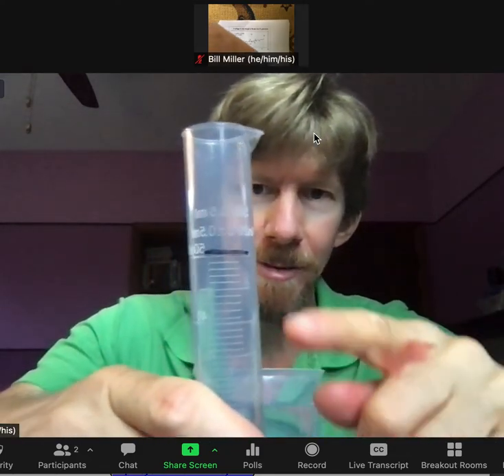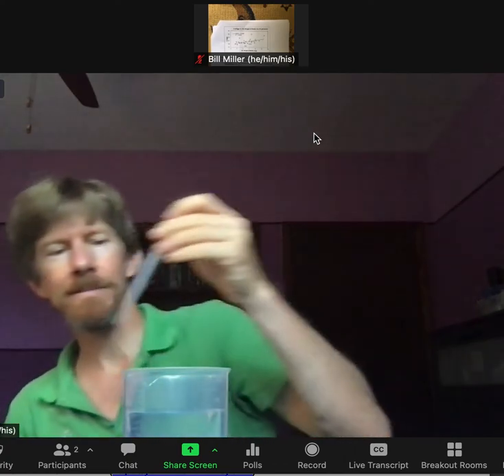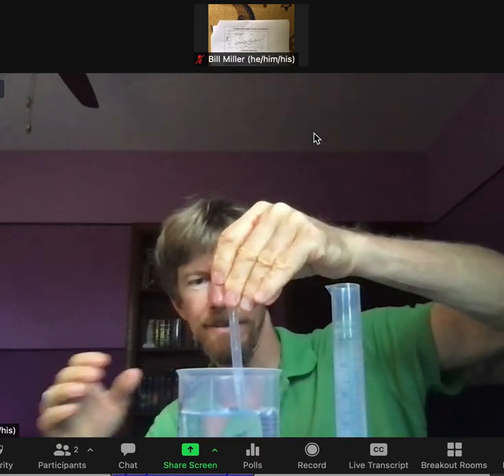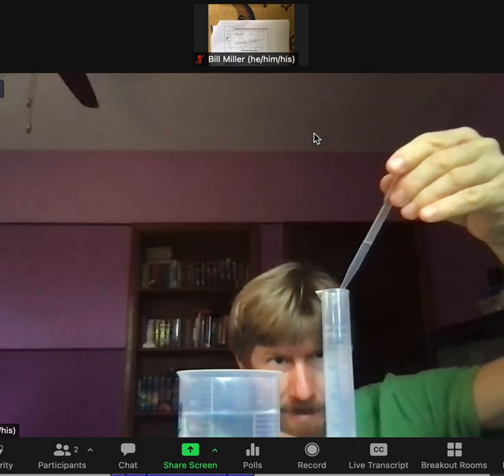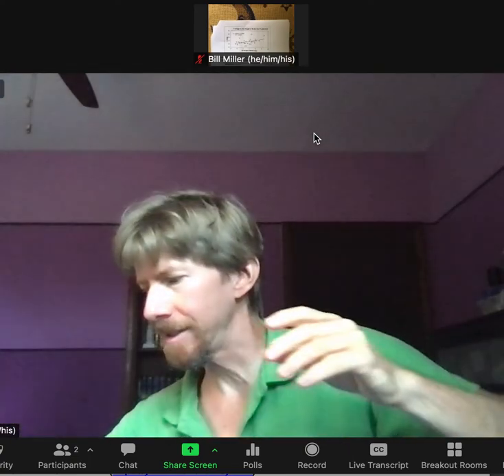Now add distilled water until it's very close to the 50 mL line. My calibration line is just above the 50 line as given. I look straight across at it — good technique says look straight across. I'm at about 48, so I'll use my pipette to bring it right to the middle of my black line. Do not go over the line. Take a picture — I look forward to seeing your pictures.